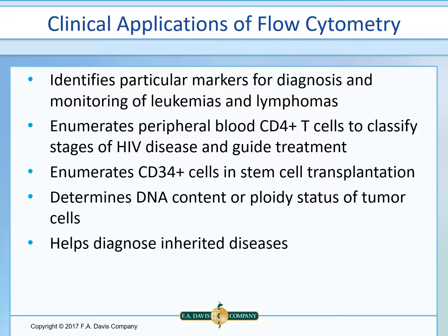And finally, one last important use for flow cytometry in clinical diagnosis is in cytometric bead arrays. In this technology, various sizes and different fluorescent beads are used to determine multiple analytes at the same time. For example, 6 different sizes or colors of beads could be coated with 6 different autoantigens, and then patient sera is added, followed by fluorescent anti-IgG. If the patient has any autoantibodies, the respective bead will be fluorescent and can be identified and quantitated.